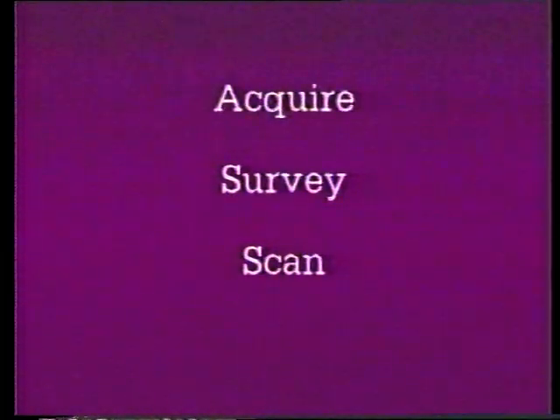Since this is a new area, there might be some material present here that we did not find on our first area. So let's begin with a survey scan by pressing function key number 5. We can avoid entering the menu. Once again, we have the parameters set up. By pressing function key number 5, the survey acquisition will begin.